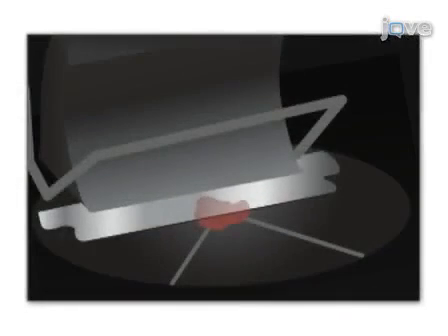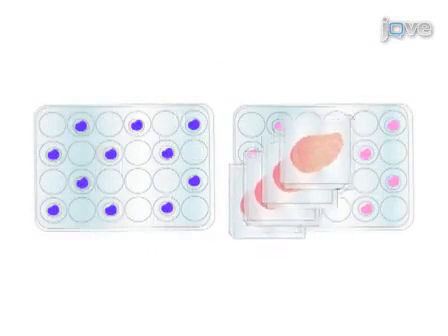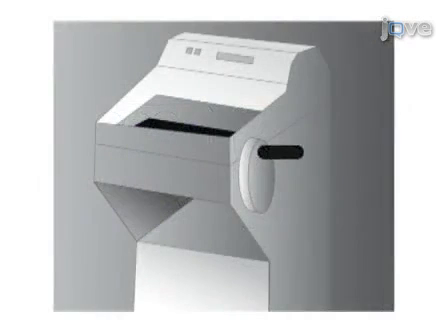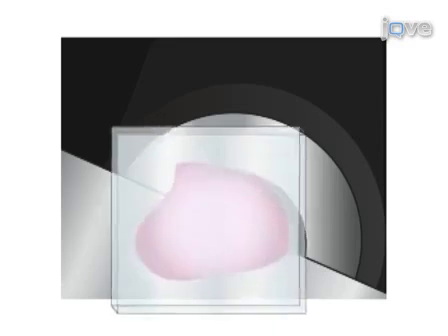The tissue is cut into 200 micron thick sections using a vibratome and stained for viral antigen-specific CD8 positive cells using FITC-labeled MHC tetramers. After freezing, these stained sections are further cut into 8 micrometer thick sections using a cryostat, and in situ hybridization is performed to localize virally infected cells.